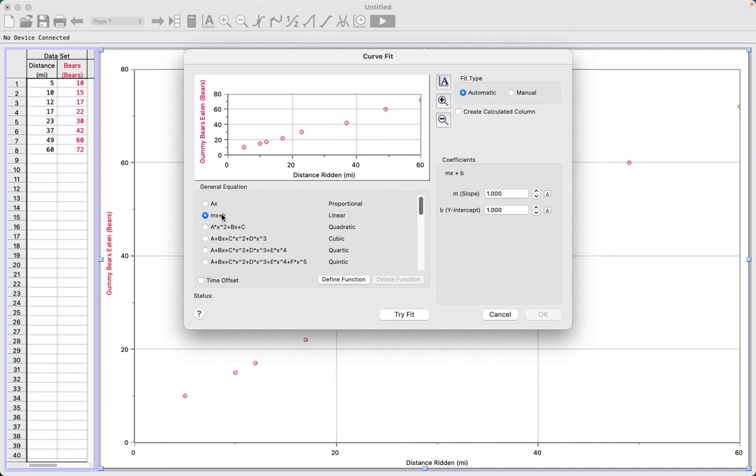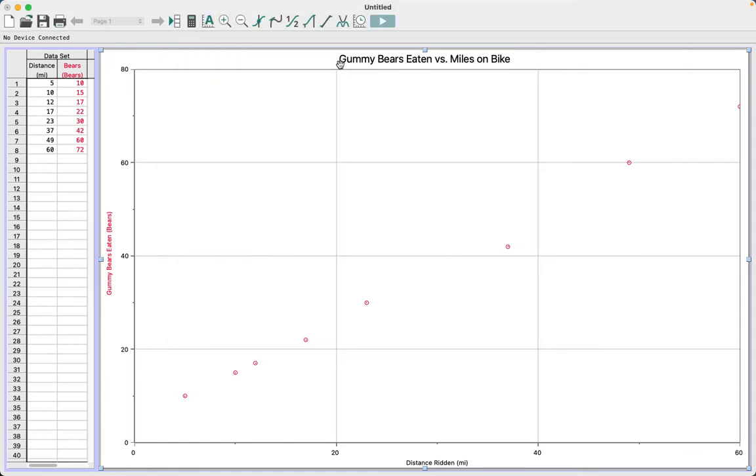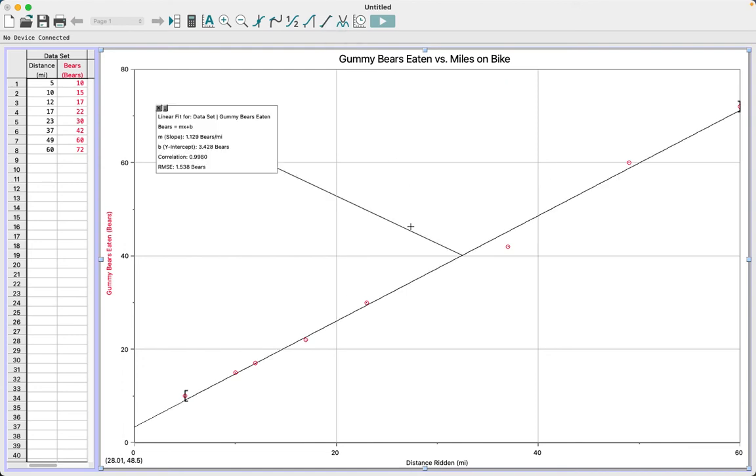This is kind of cool. If I select it here, then right-click, try fit, it'll show me what it looks like automatically. Instead, I'm going to pretend we didn't do that. I'm going to go up here to the linear fit and just press it. Now it gives me a couple things. Shows me a bracket around which data points that linear fit goes through. It shows me the linear fit. Because I have my nice point protectors, I'm able to see those.